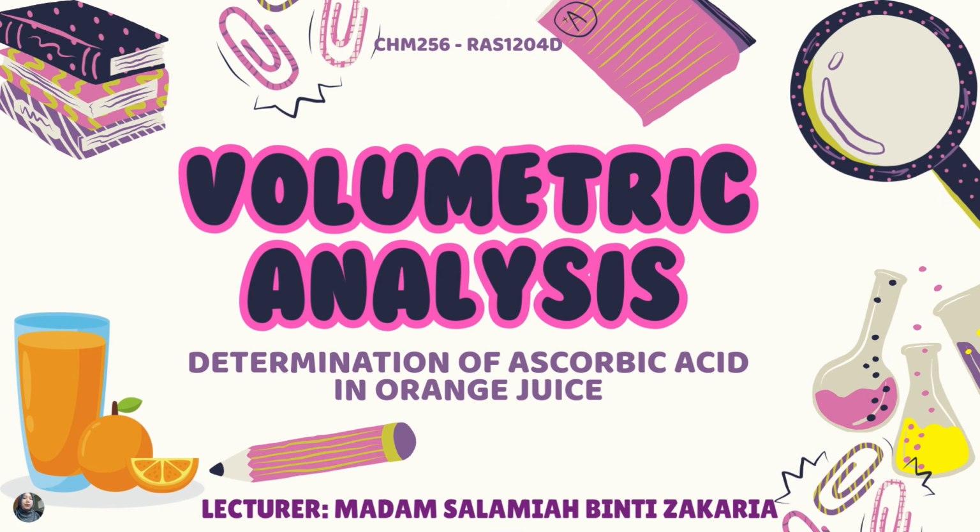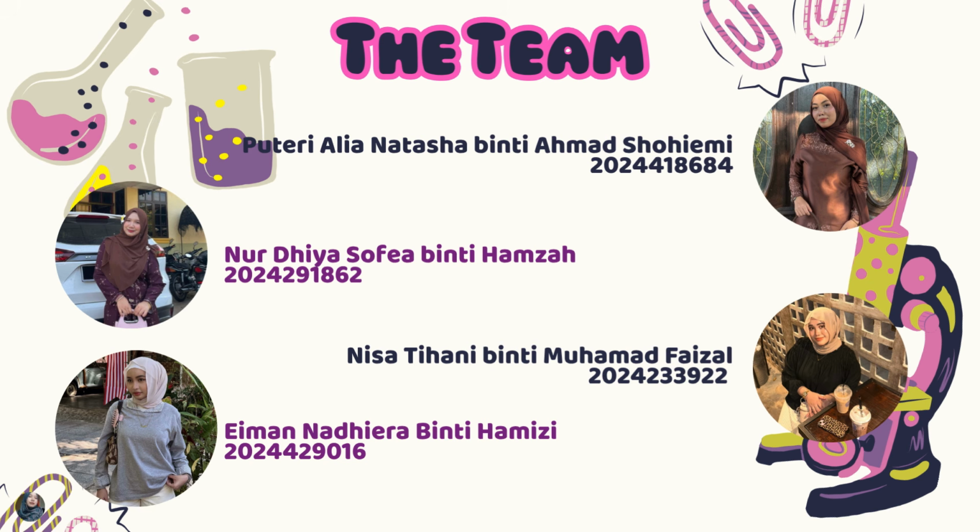Assalamualaikum. Today we'll be presenting our CHM256 project on volumetric analysis, the determination of ascorbic acid in orange juice. Our team consists of 4 members, Putri, Tihani, Nadira and myself, Tia.